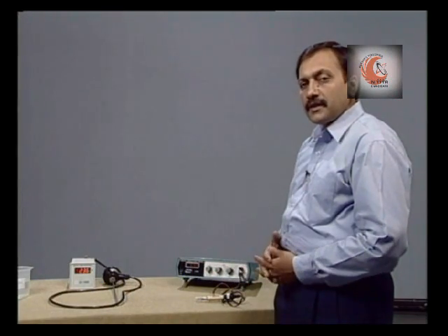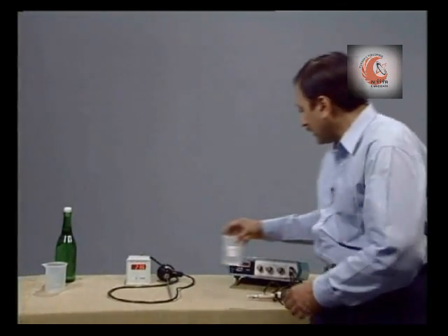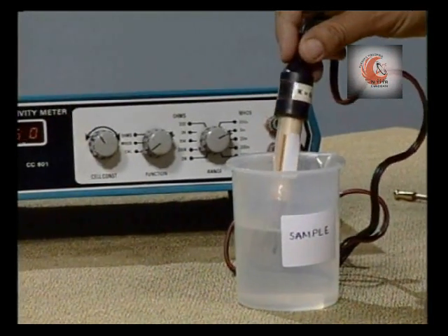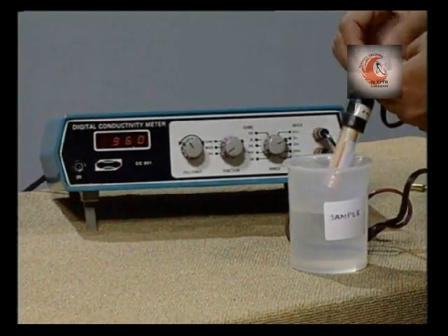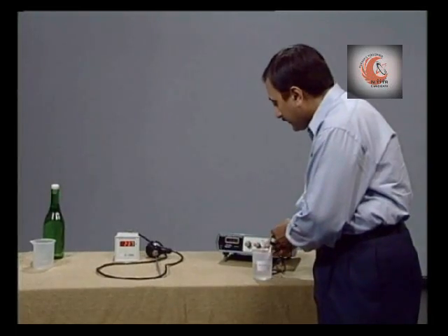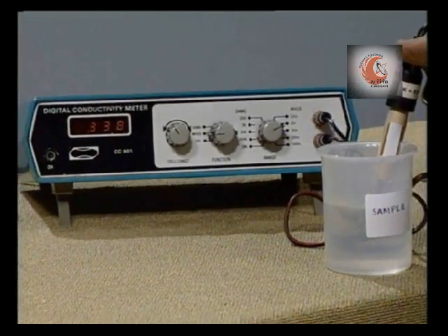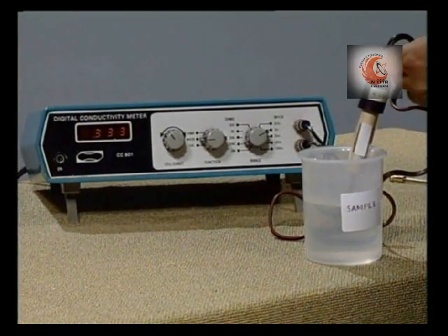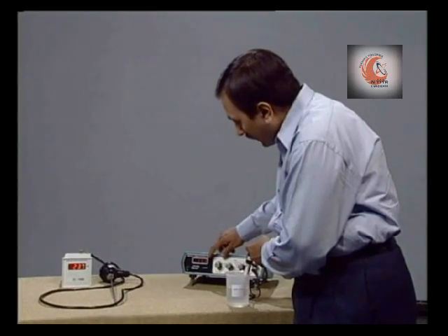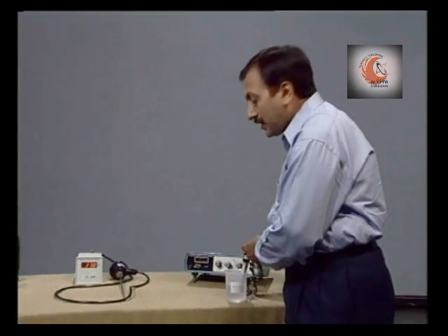To measure the conductivity of a sample, we will take the sample and simply dip the cell in it, put the instrument in mhos. So the meter is displaying 0.331. This indicates that the reading is in the low range.